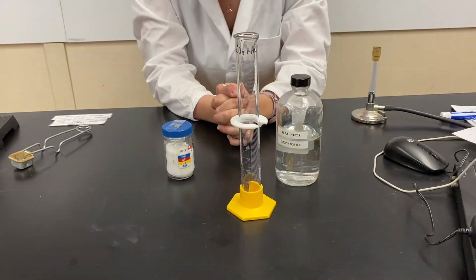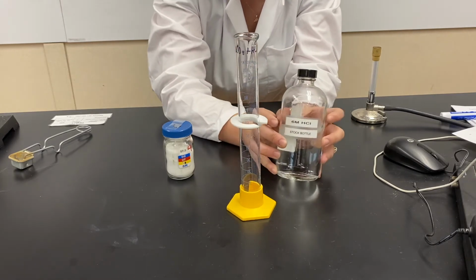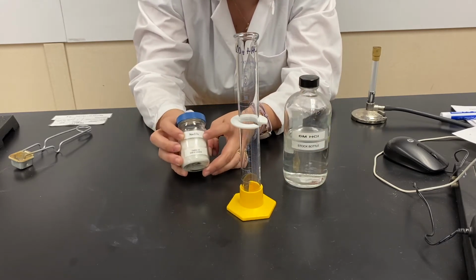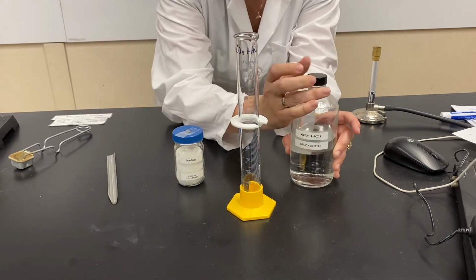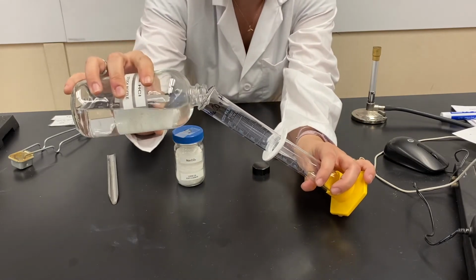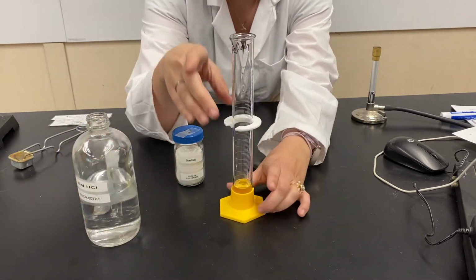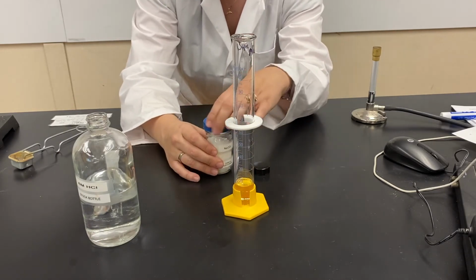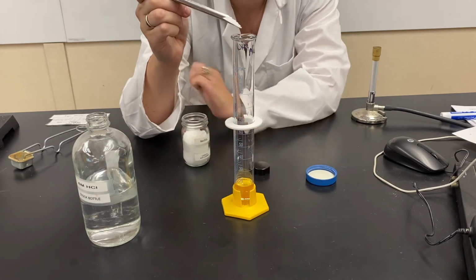Basic. All right, and for this beautiful double replacement reaction, I'm gonna have some 6 molar hydrochloric acid, and I'm going to add some sodium carbonate into it, okay? So we should see some kind of reaction. So there's my 6 molar HCl, and I'm gonna add some sodium carbonate here. Ready, set?